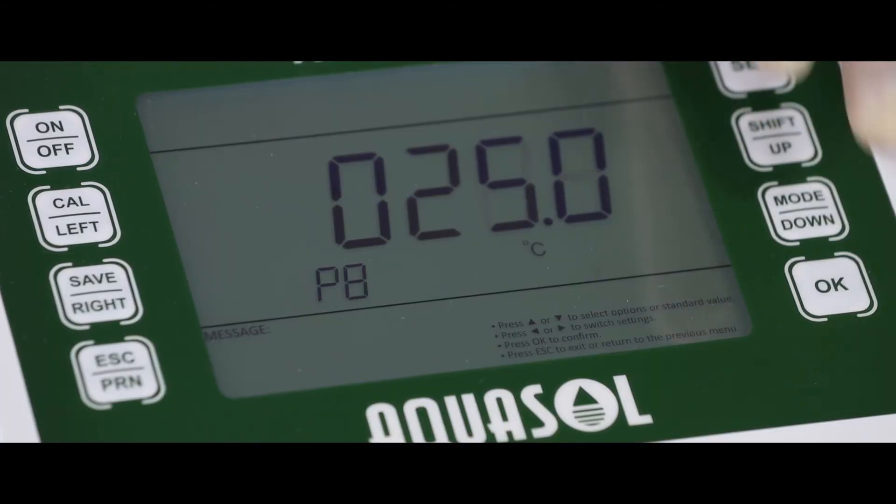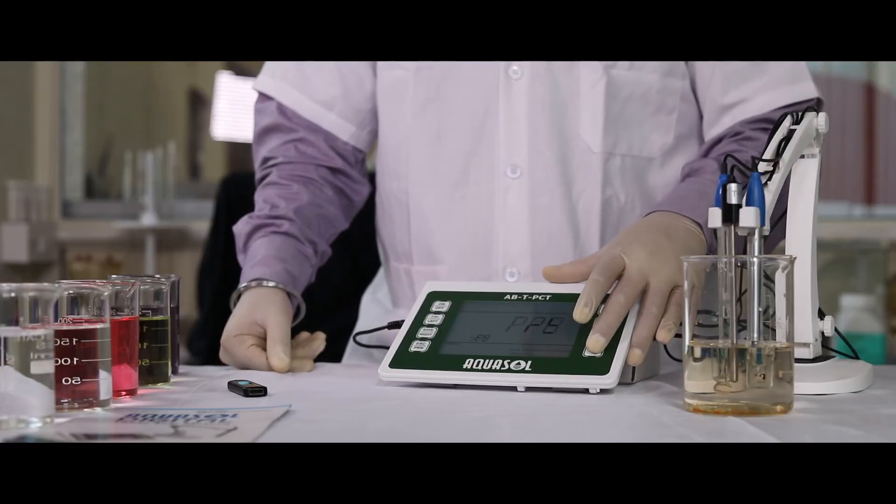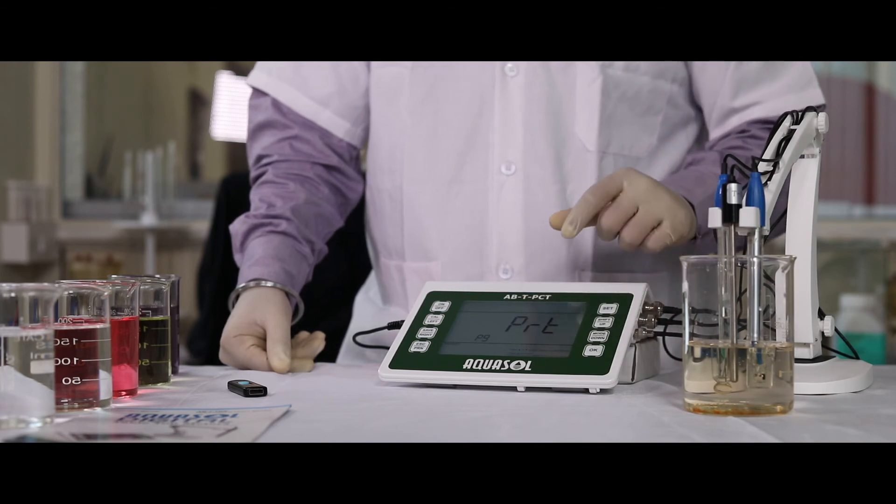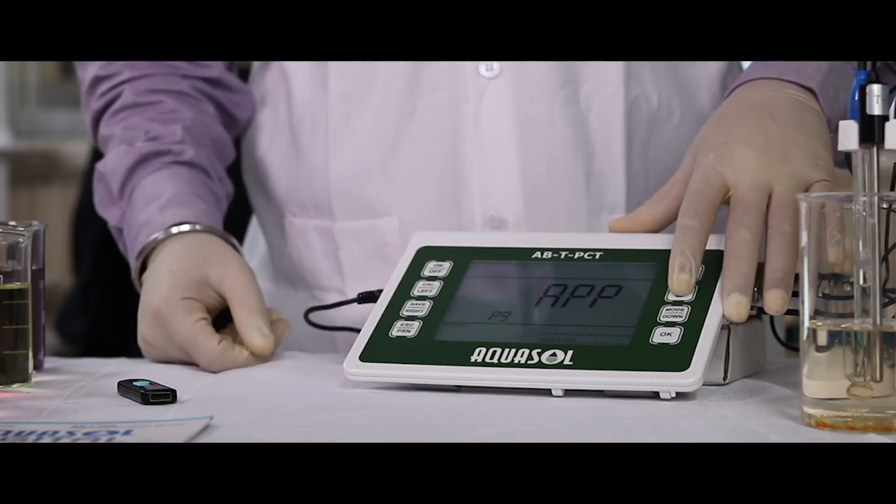P8 to enter the temperature of the solution manually. P9 to select Bluetooth operation mode. To print meter reading on Bluetooth printer. App mode to connect Android app.